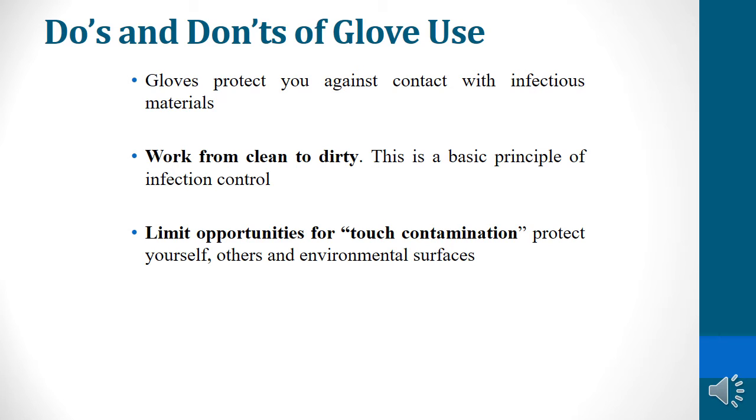Dos and don'ts of glove use. Gloves protect you against contact with infectious material. Work from clean to dirty; this is the basic principle of infection control. Limit the opportunity for touching and contaminating. Protect yourself, others and environmental surfaces.